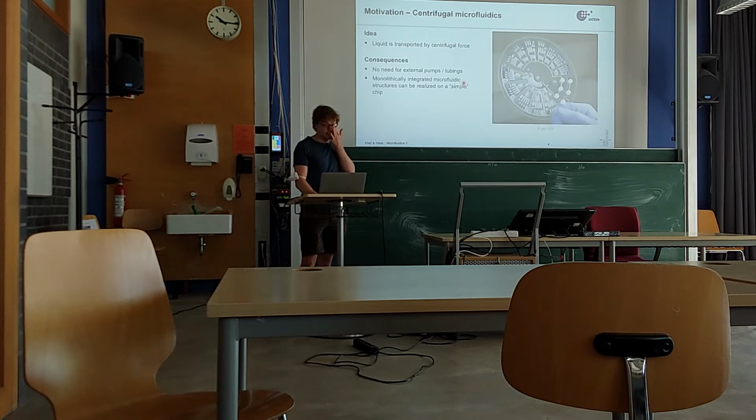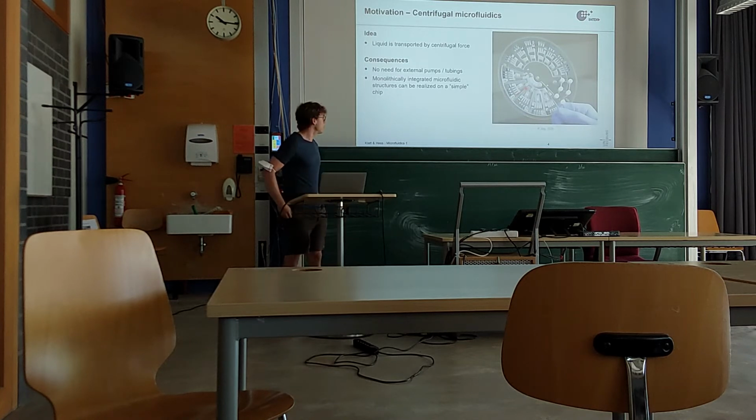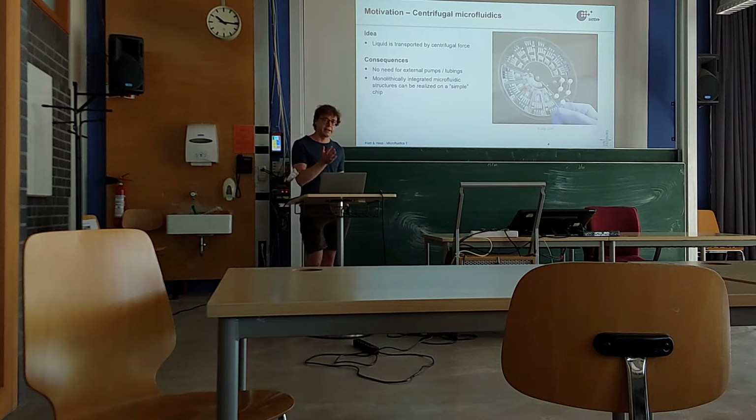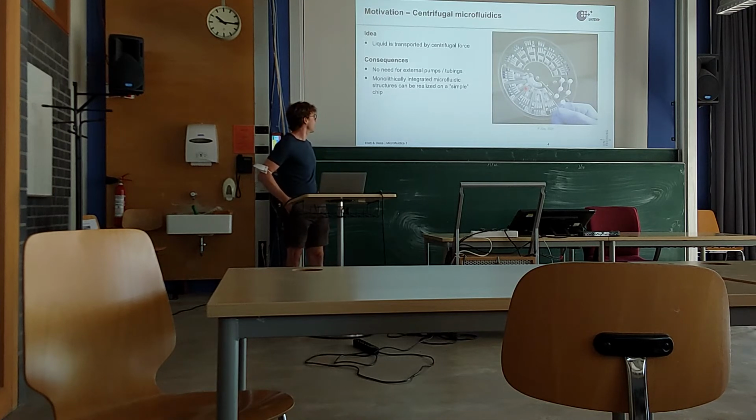A second thing that comes along with this principle of the centrifugal force transport is that you are able to build monolithic cartridges. So what does this mean? You can basically, yes, so it's really the contrast to what Niklas presented last time, that you have these PDMS chips which need to be pushed onto glass chips and so on.